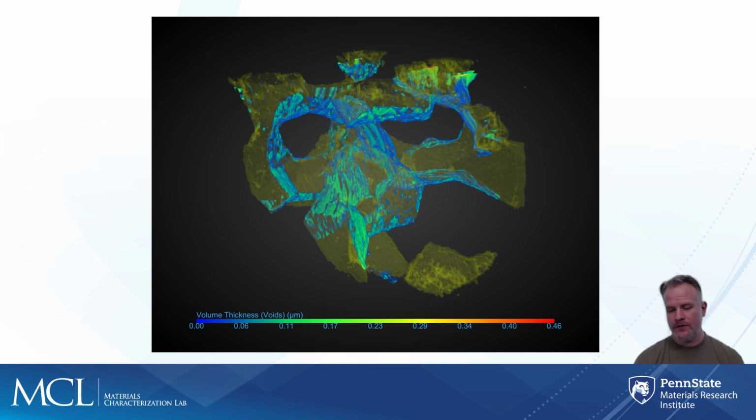Here, total overlay gives me a handle on where, relative to that lead, these voids are occurring. This could be an indicator that lead, at least with these grains, is starting to break down and could present structural problems. Heating could cause inclusions or other things that could give problems in circuitry.